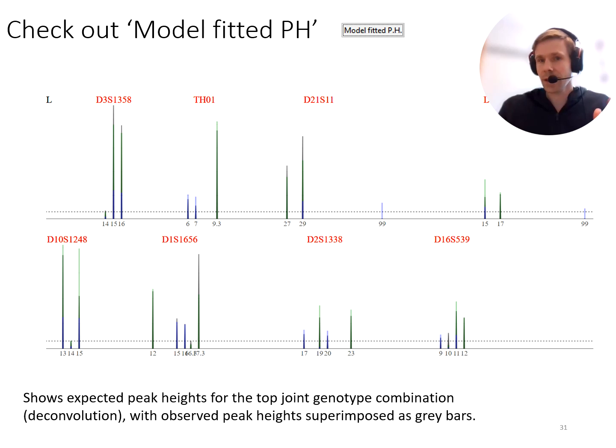So it's nice to see how these two contributors convolve into the evidence profile. Here are the situations where the minor profile component did not match the true profile. This is something I added on top of the plot, just to visualize that.